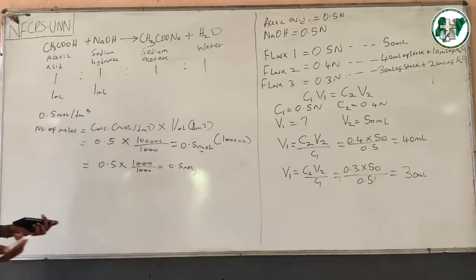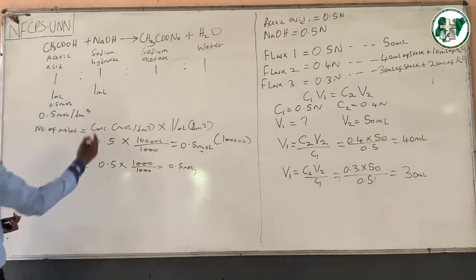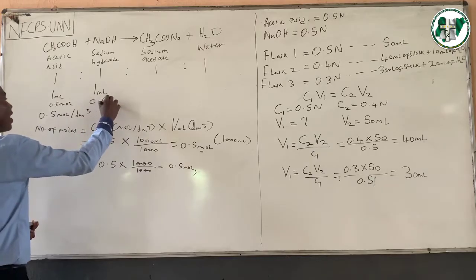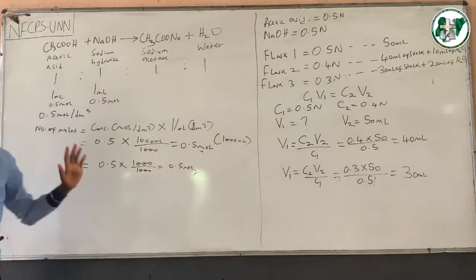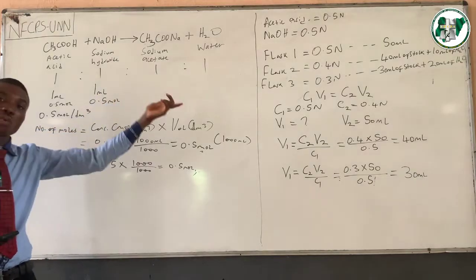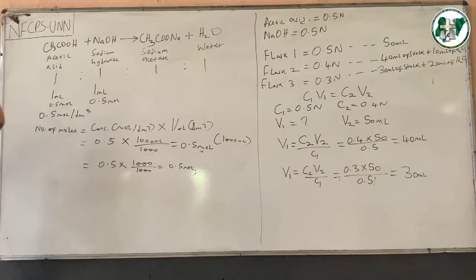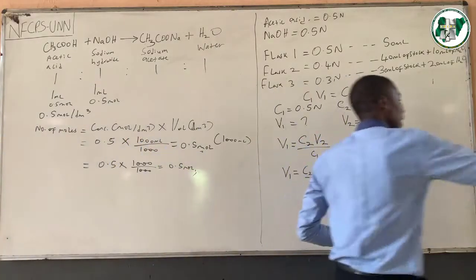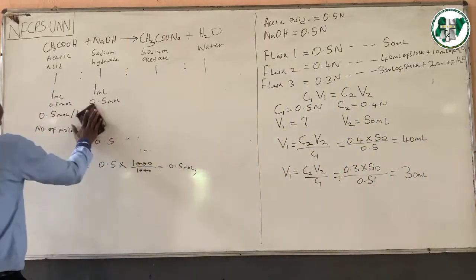So you can already see for yourself that 0.5 mole of acetic acid is automatically going to be reacting with 0.5 mole of sodium hydroxide by reason of the fact that the reaction is a 1:1 reaction. So, since the concentrations are equal, we cannot use volumes to navigate which should react with which, or to what extent it should react. That now brings me back to the explanation of the practical itself.